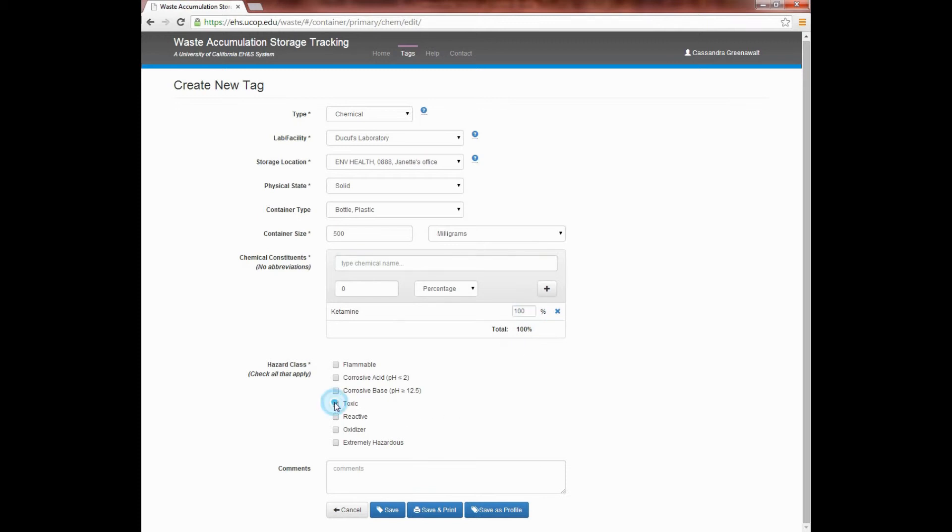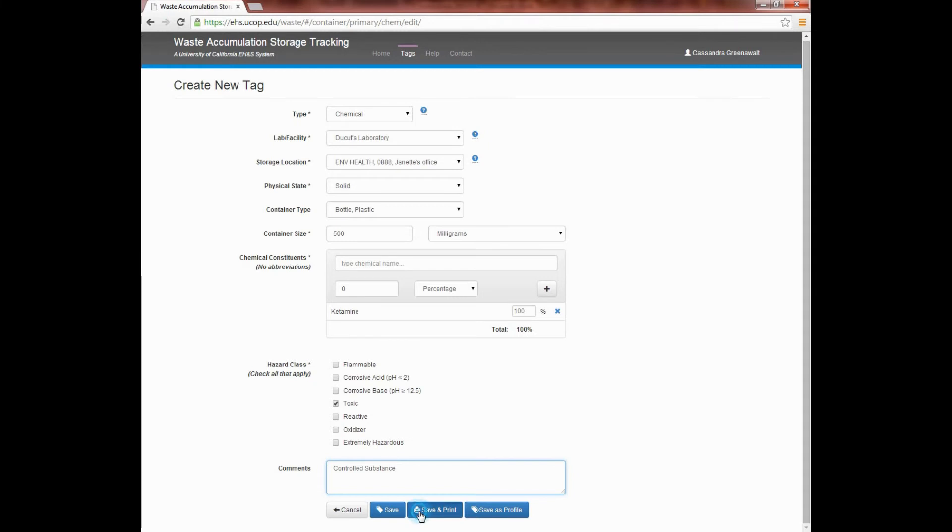Then select the appropriate hazard class. For more information about hazard classes, refer to the safety data sheet for your chemicals. Please note that if you're working with a controlled substance, then the words controlled substance must be added to the comments section. When you're ready, click on Save and Print.